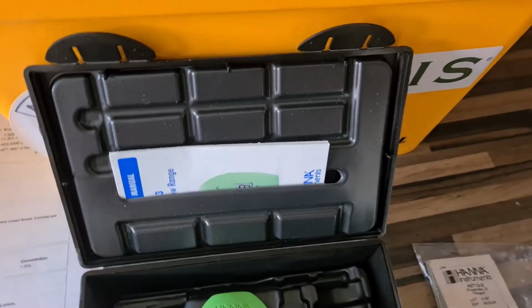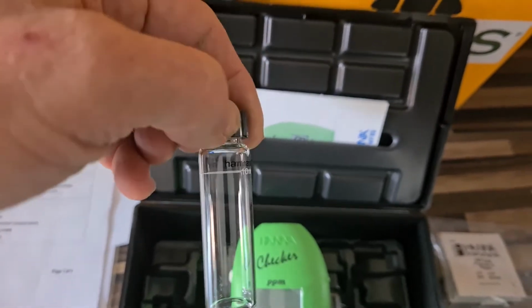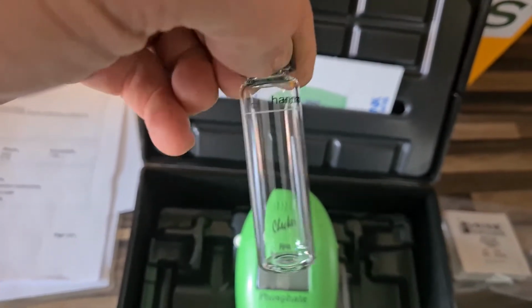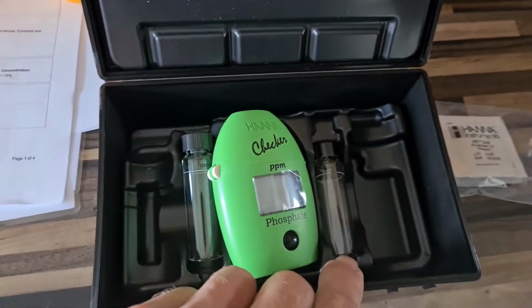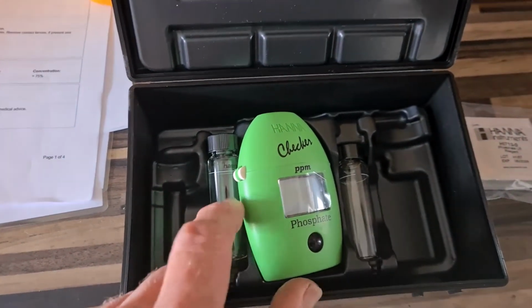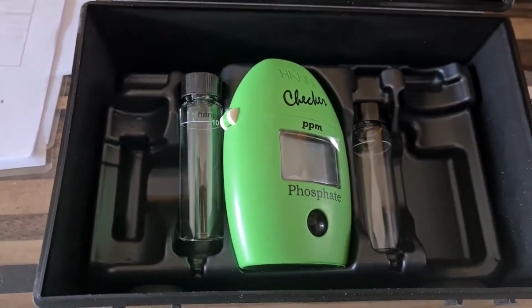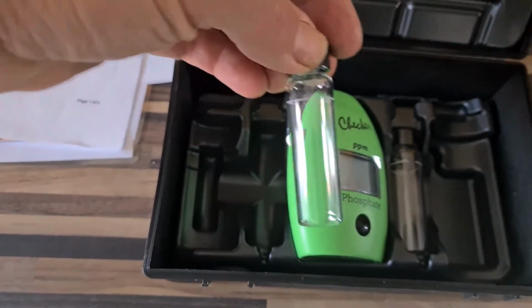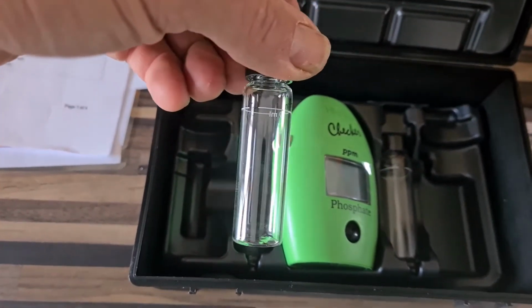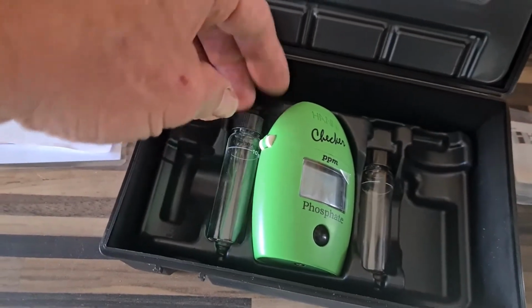And basically, you'll put in one of these capsules. There's 2 in there. It's advised you put clean river water in one to calibrate it, and then there's a second one there to put your river water and your reagent in, and that goes back in there to check your phosphates. They do say in the instructions, ensure the glass is clean and free of fingerprints before it goes into the checker in both cases, because obviously it works on some sort of optical process, so if it's marked you're not going to get a proper reading.